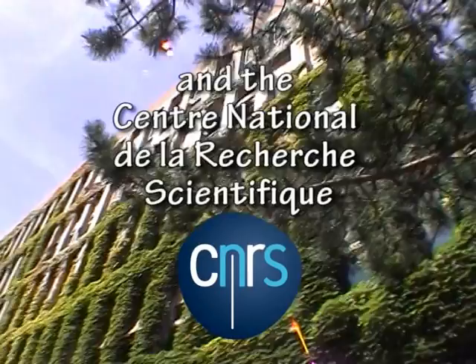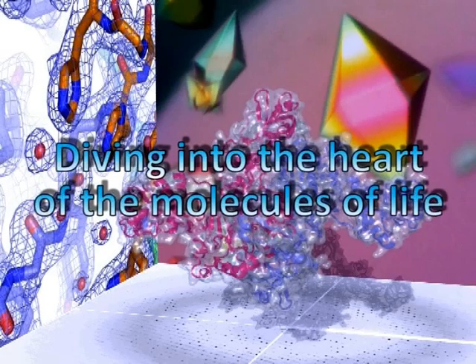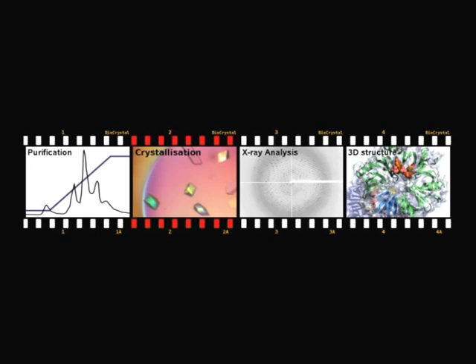The molecules that constitute living organisms, from a single bacterium to the cells of a human body, are a major focus of modern biology. But these biological macromolecules are too small to be observed directly using a microscope. Gaining images of these molecules is, however, important for understanding what they look like, how they function, and how they interact. During this film, we will see the steps that lead to the visualization of a biological macromolecule in three dimensions. This image, or three-dimensional structure, allows us to appreciate the shape of a molecule and better understand its role inside a living cell.